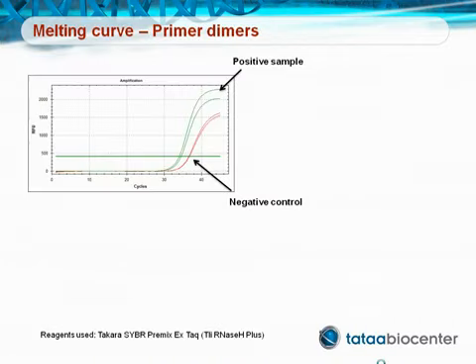When running qPCR with an assay with dye-based detection, you may get an amplification rising also in your no template control. If this is not from contamination of DNA molecules in your master mix, it probably is from primer dimers. Primer dimers are short, unspecific products that are formed from the primers. If the sample has no target DNA or very low amount of target DNA, it is more likely that those unspecific products are formed than if you have a lot of target DNA.